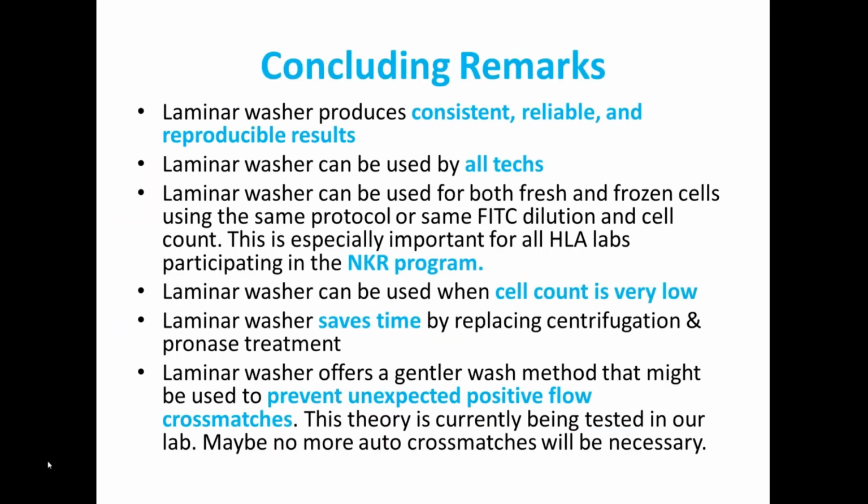But to conclude, the laminar washer produces consistent, reliable, and reproducible results. The laminar washer can be used by all techs. The laminar washer can be used for both fresh and frozen cells using the same protocol or same FITC dilution and cell count. This is especially important for all HLA labs participating in the NKR program. The laminar washer can be used when cell count is very low. The laminar washer saves time by replacing centrifugation and Pronase treatment.